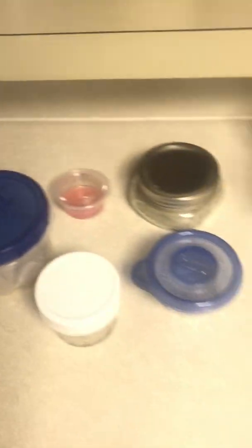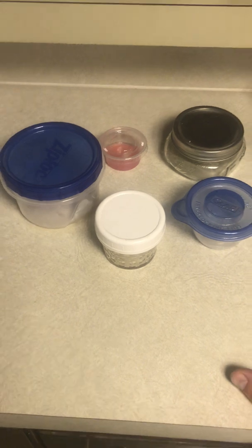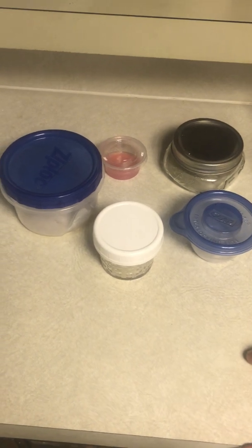Now that you've got a spot cleaned off and you're wanting to work, here's some different containers that you can use. I'm showing these four together because these are my least favorite to use, but they are definitely still able to be used.